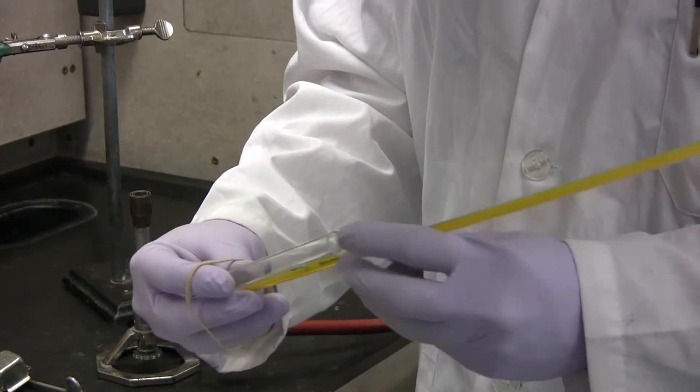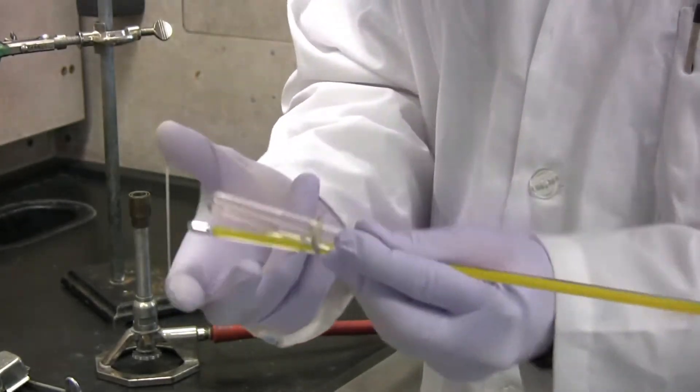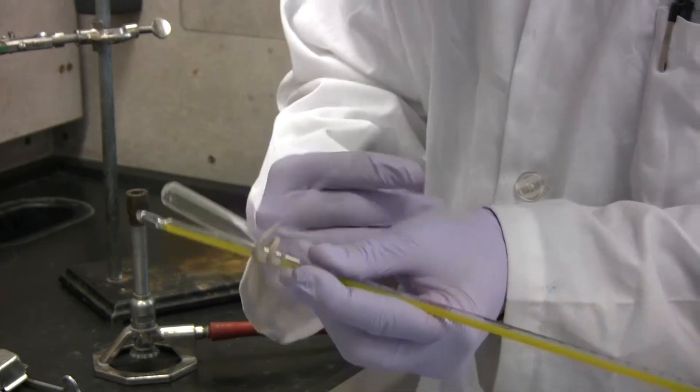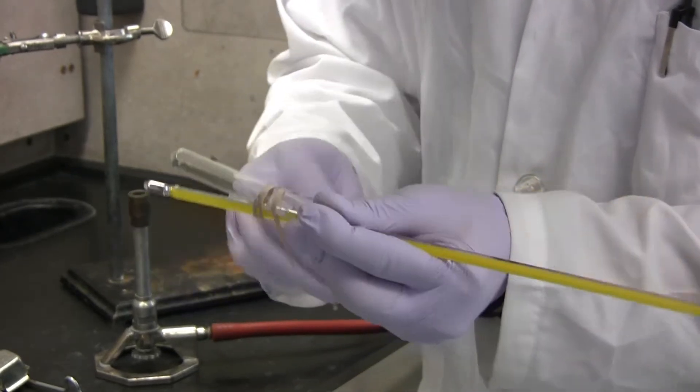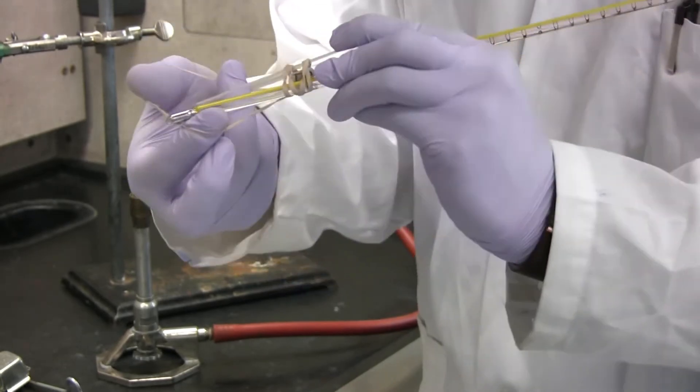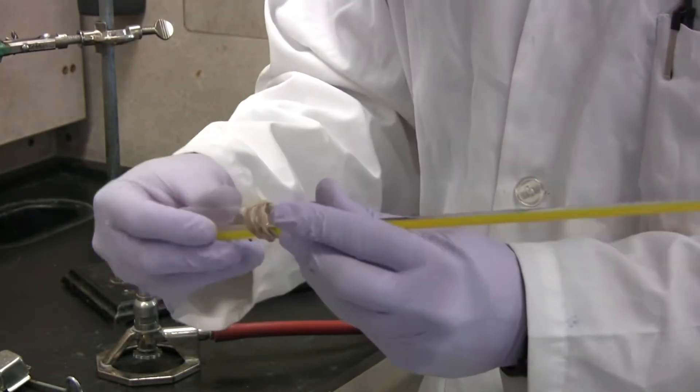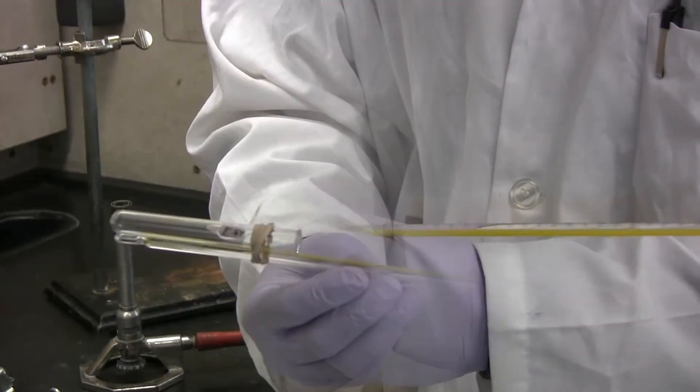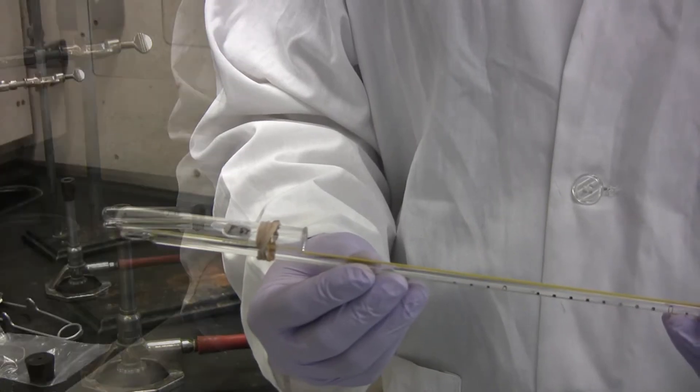Attach the small test tube to the mercury thermometer using a rubber band. Ensure the bottom of the test tube and the bottom of the mercury thermometer are lined up. Place the rubber band near the top of the small test tube.